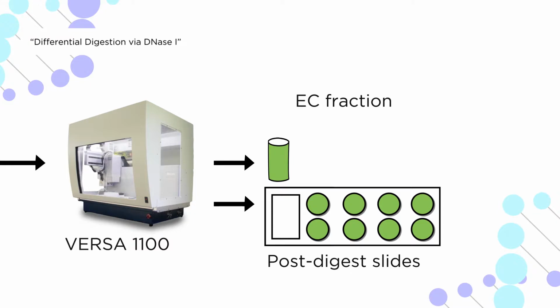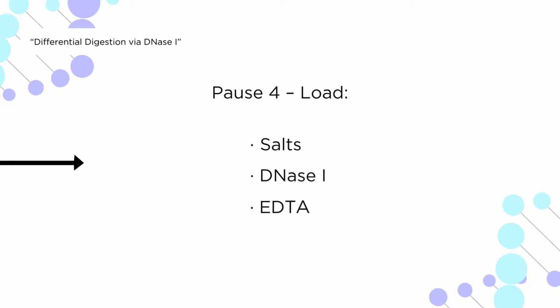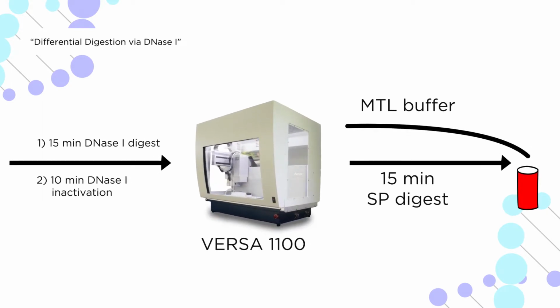Finally, to clean up the sperm fraction, DNase 1 is added to ensure no DNA remaining from the epithelial cell fraction is present. The DNase 1 is then deactivated before the sperm fraction is digested in order to be placed into tubes again to go on to extraction.